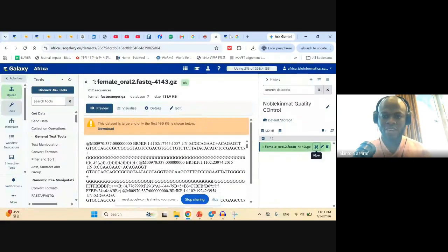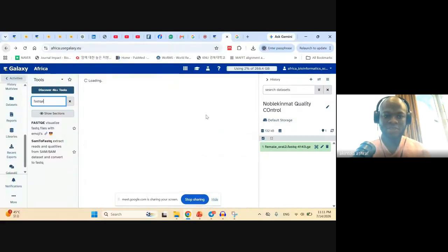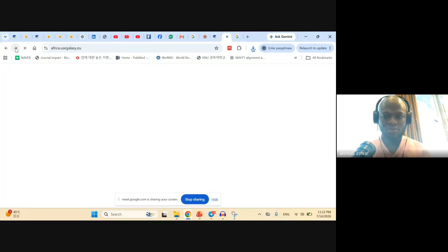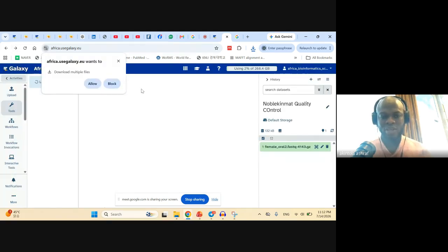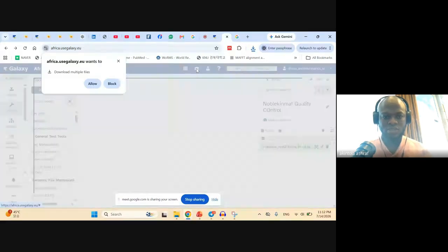But let me go back so that it won't distort what we were doing before. I'm very sure it will distort the process that you have been doing. But let's click on this.